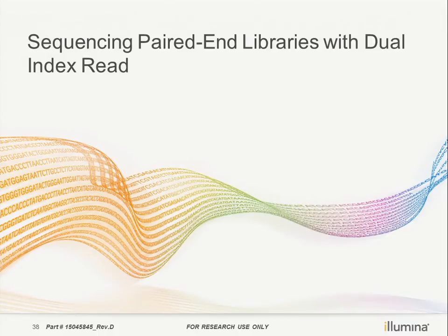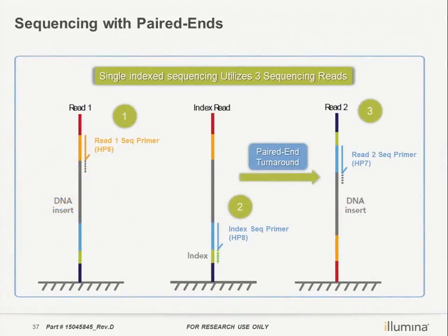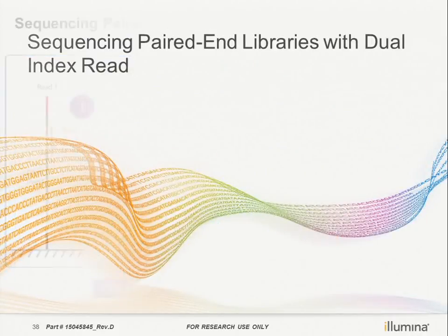So what about if I have dual index? For some libraries, we will have dual index, especially when you're going to pool a lot of samples. Say I'm going to pool 100 samples for an amplicon sequencing. Then, of course, you can design it this way, but that means you need to have 100 unique indexes. Single index is usually around 6 to 7 nucleotides. For such a short oligo, getting 100 or more combinations is quite hard. So people will use the dual index sequence.